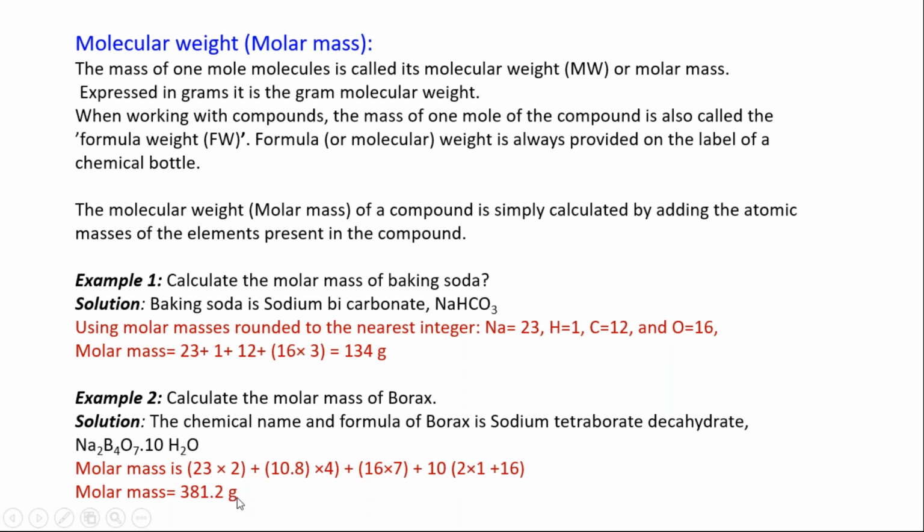If we had said anhydrous borate, then you will not add the water. So please remember, when you're doing calculations with the chemicals for any weight purposes, for any solution purposes, such as molar concentration or normal concentration or molality, please see whether it is in the hydrated form or in the anhydrous form, especially when you are making buffers.